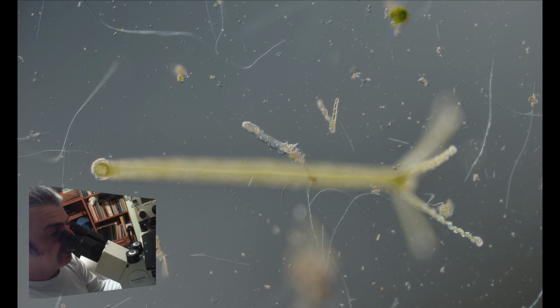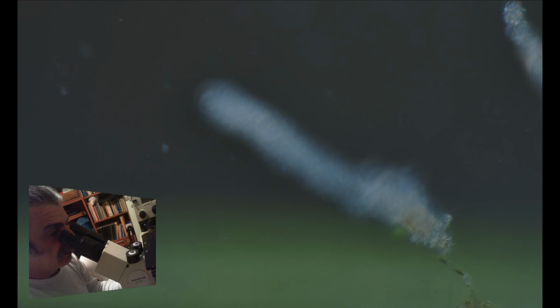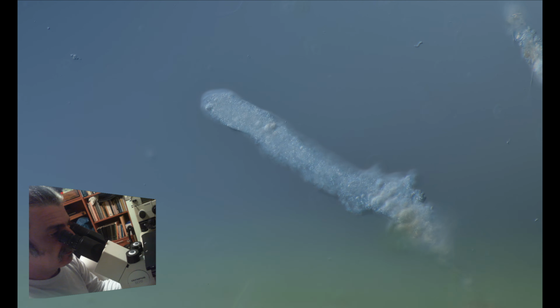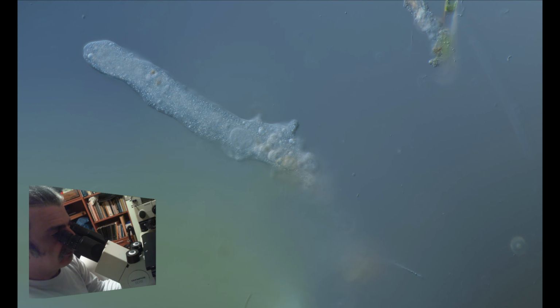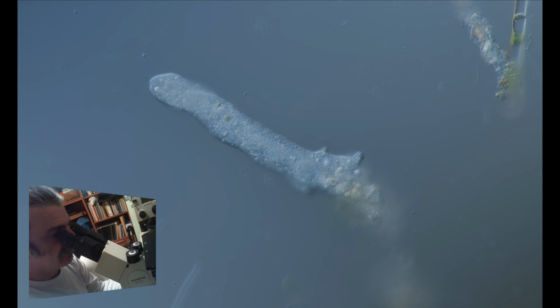And here above the hydra we can spot an amoeba. So I'm switching back to the 40, and yes, that's a very nice amoeba. It's moving very slowly, but you can see the flow of particles inside it.